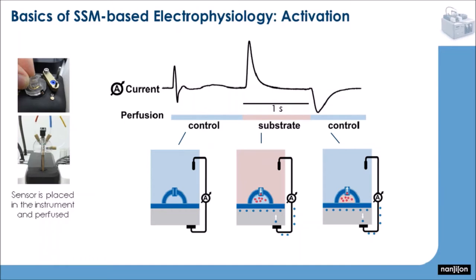Important to know is also that this activation can be repeated many times after a rinsing step. This part of the signal is what is actually interesting for us and which we will use for the analysis. So to recap, the perfusion triggers our transport activity.